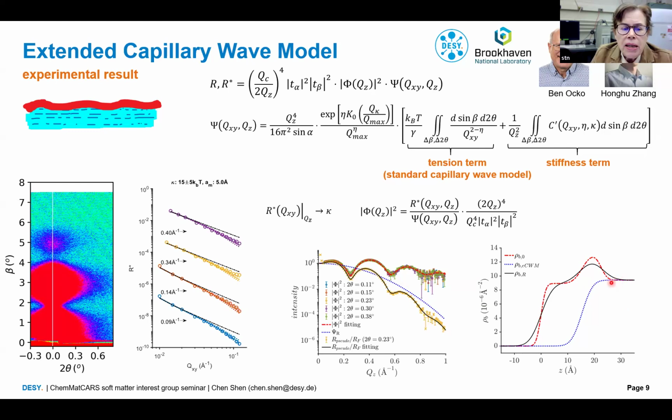Yes, I understand that. But in the figure that's all the way on the left, you have a white line in the center. That's what I'm talking about. Oh, this is the specular, the plane of incidence of the measurement. Yeah, I know. But then you had different lines going out to different degrees. In the last slide I guess you had some vertical lines at different distances. I thought that was seen here in the figure right next to the one on the left. That is correct. We chose 4 line cuts here as an example. So, of those different distances, which one is the preferred one for you to get the structure?